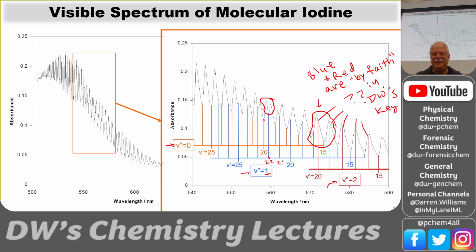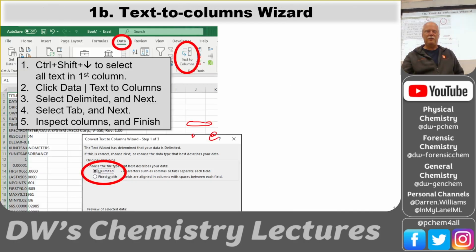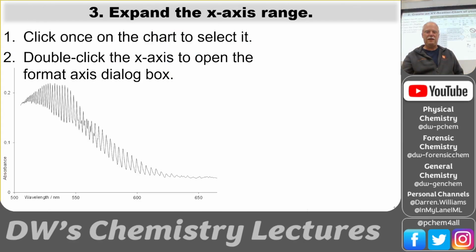Yeah. And if you wanted to say, well, I don't believe in DW's key and not include just those 3, the blue and the reds, we can see what happens to the lab, but you would have to justify that in your procedure and say, I wanted to see how far off my values were if I didn't include them, and who knows, maybe they get better. I don't know. But that'd be for the advanced student that wants to write a little bit more in their lab report. Okay.